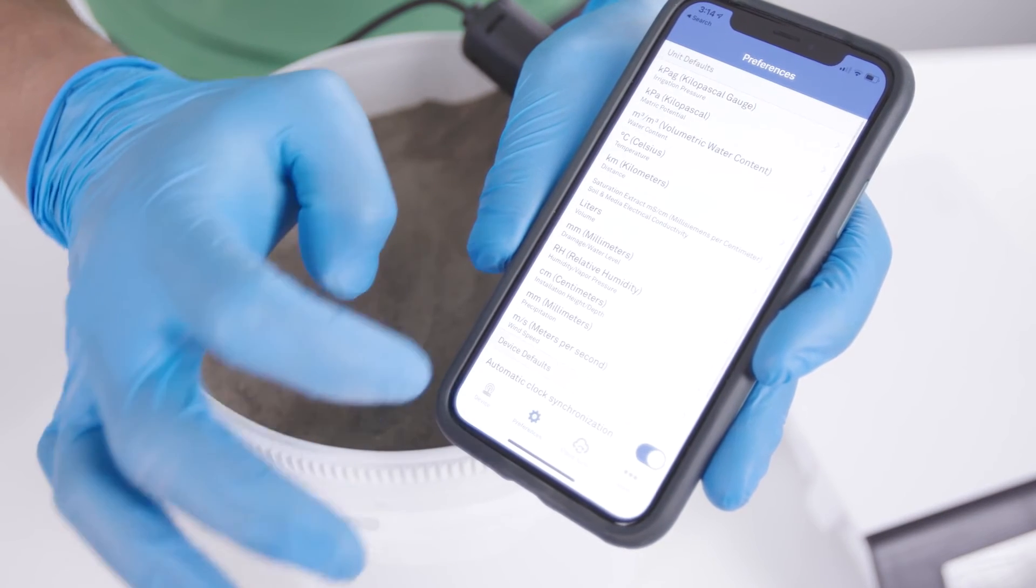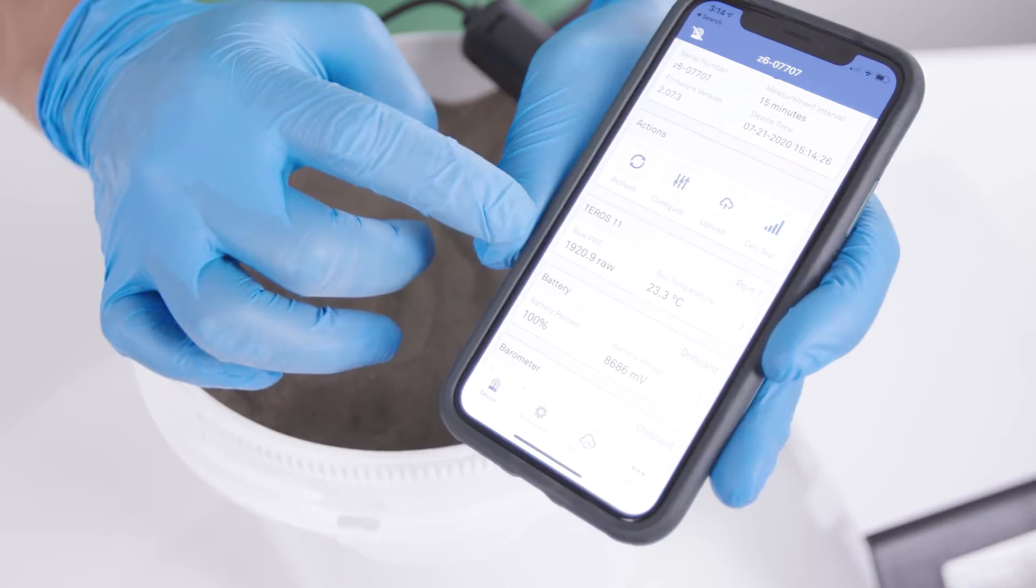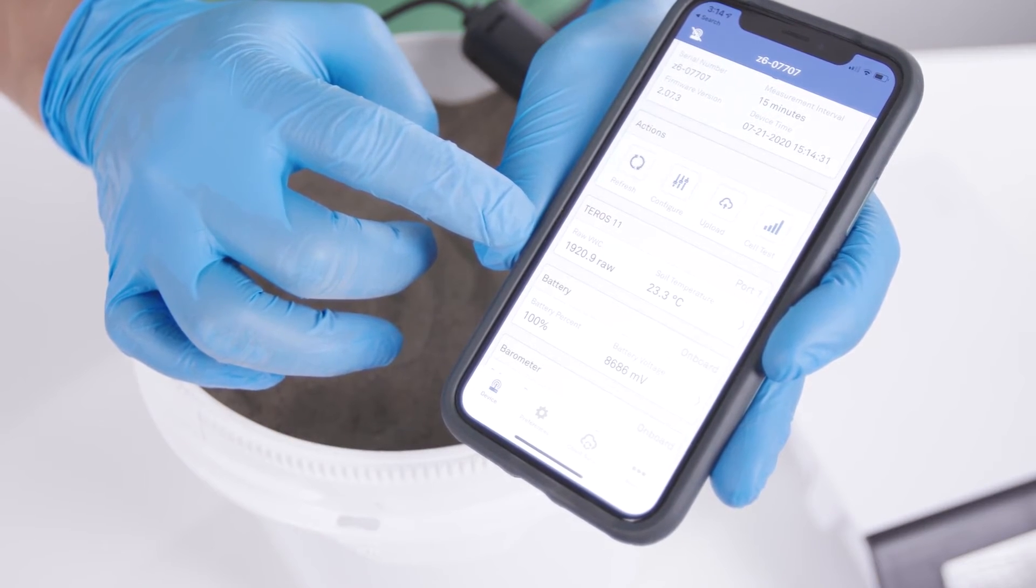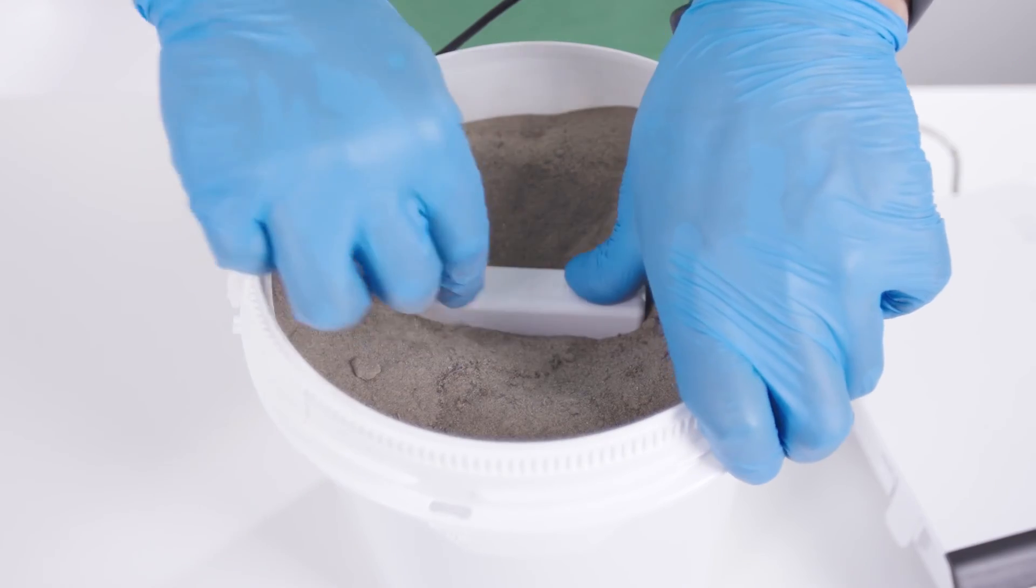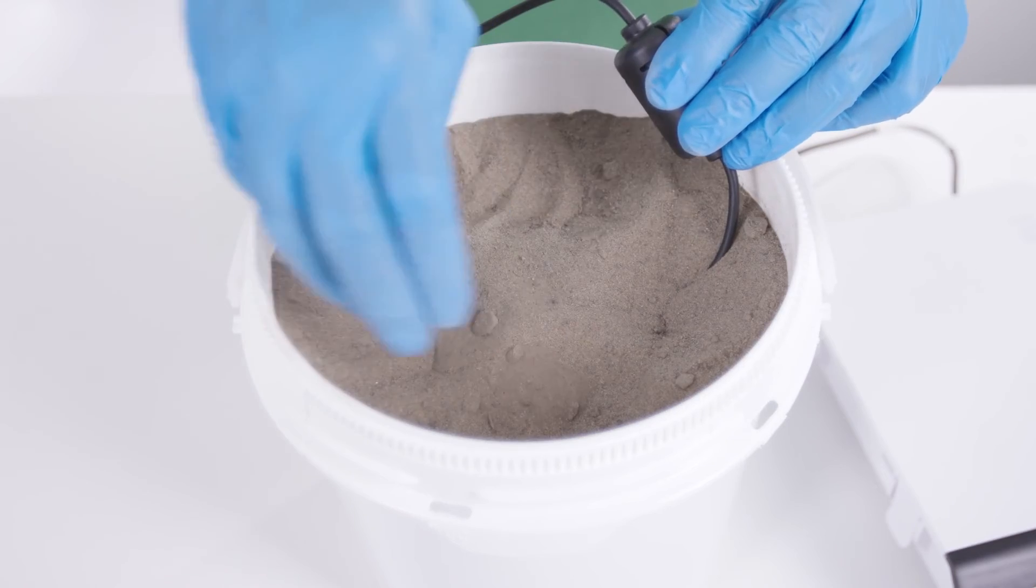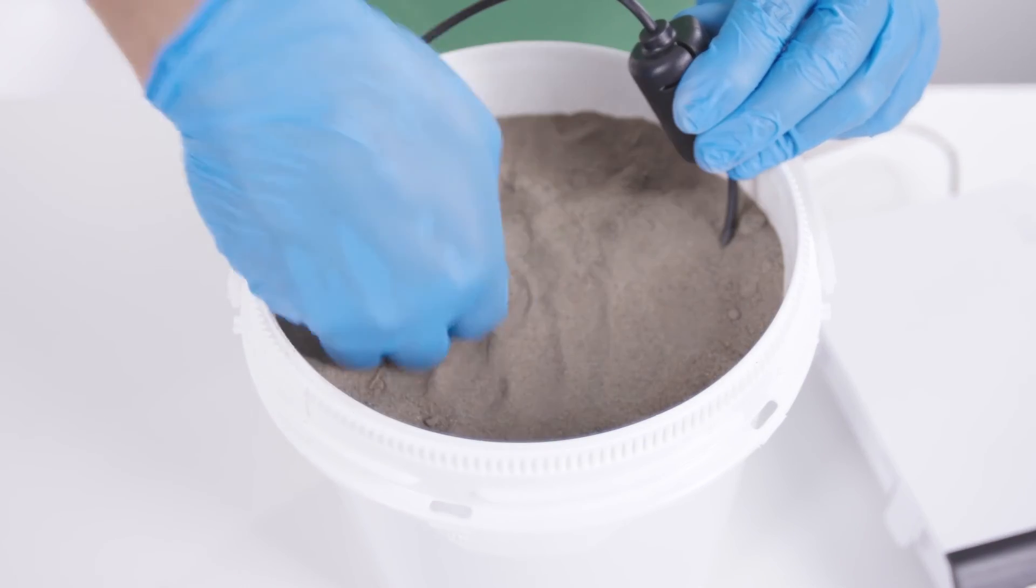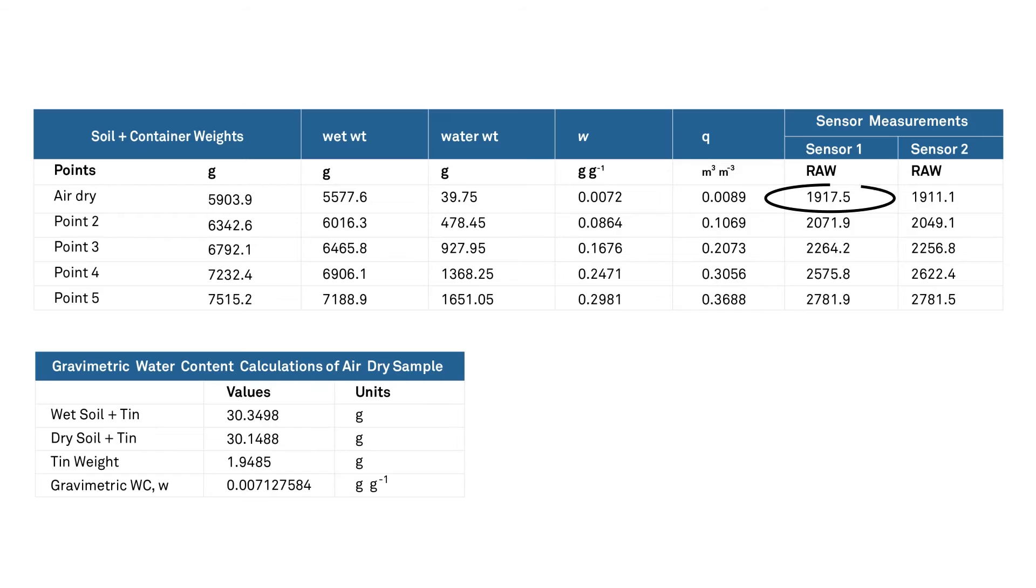Take a sensor reading. If using non-meter data acquisition equipment with an EC5, be sure you are exciting the sensor with the same excitation voltage you will use in the field. All other meter sensors regulate their excitation voltage, so refer to the manual for the appropriate voltage range. Collect the raw data from the sensor with no calibration applied. It's a good idea to repeat the steps of sensor insertion and taking a reading once or twice to ensure you're achieving repeatable insertion quality. Be careful not to insert the sensor into holes you've already made. There will generally be some small variability in readings, a few raw counts or millivolts, so an average reading can be taken. Record sensor readings in Table 1.